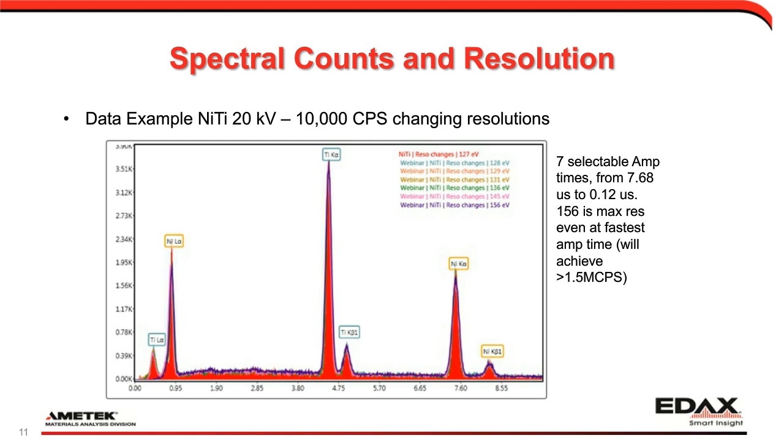There's a question about the peak broadening, whether it will affect the quantification numbers, and this is part of what Tara was highlighting, that if you have a fixed input count rate or fixed output count rate, of course you'd like the better resolution, but we normally don't just change the amp time and stick with the same output count rate.